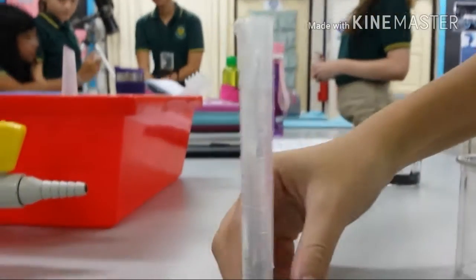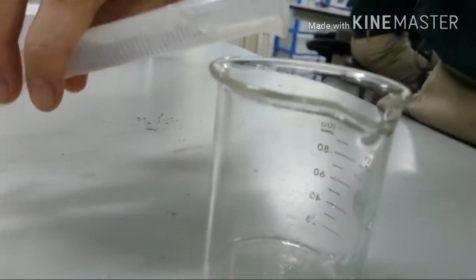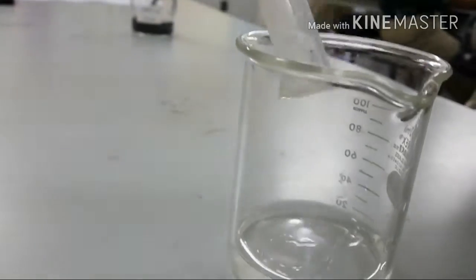Okay, I'm ready, let's go. Pour the sulfuric acid inside this beaker. Okay, got it. Pour 10 centimeters of sulfuric acid inside the beaker.